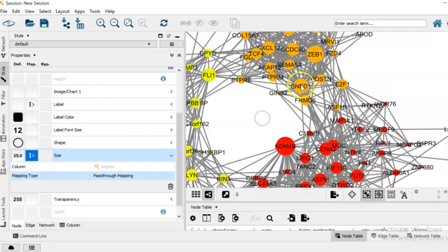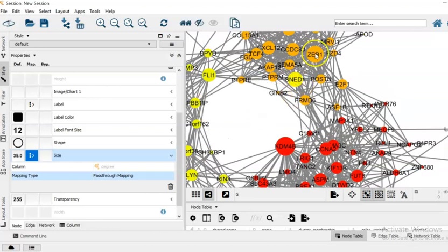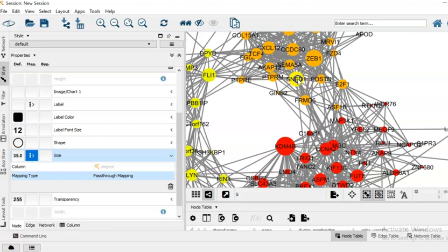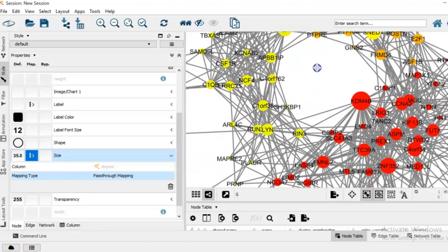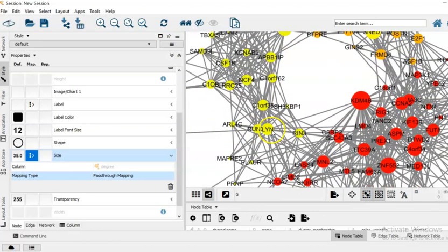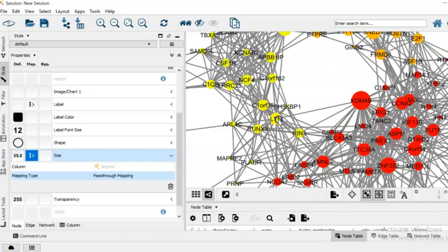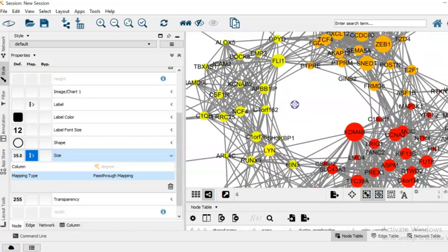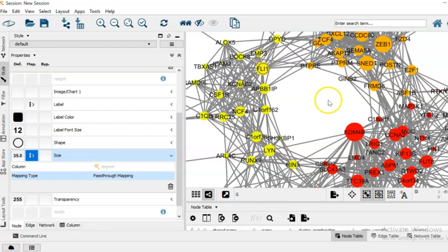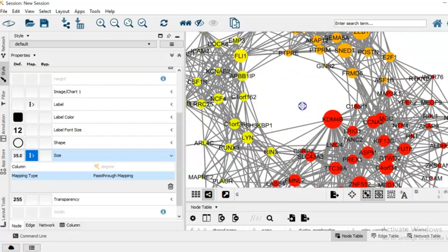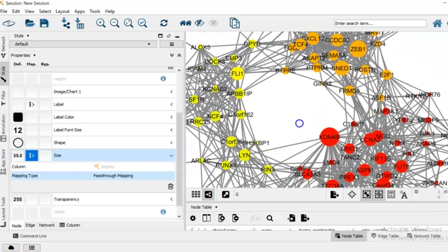So for the orange community we have zep1, and then it is followed by snet1. And for the yellow community we have this fly1.